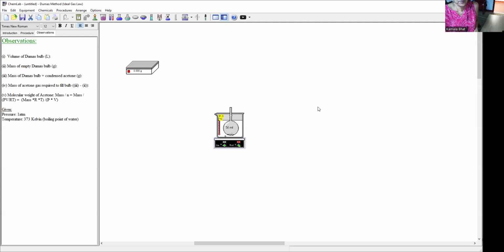And there you go. It's almost towards the end. The water has started boiling outside. That's a good sign. The water is coming towards 100 degrees, and the liquid inside the flask is decreasing.